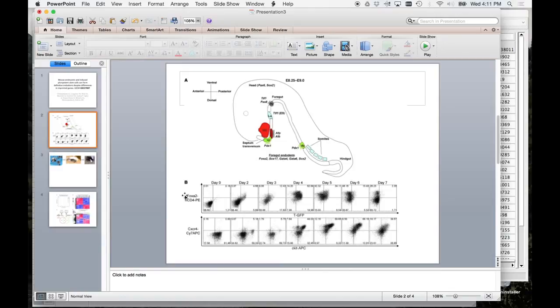So they're using these markers of endoderm development to take a sample at day 0 before they're induced, and then at day 5, when most of them show that they're differentiated. And they know that based on the markers that they use. So when we go into those files, you'll see sorted by blah, blah, blah. They're sorting by these markers here, and they're doing that so they can only get the differentiated cells.